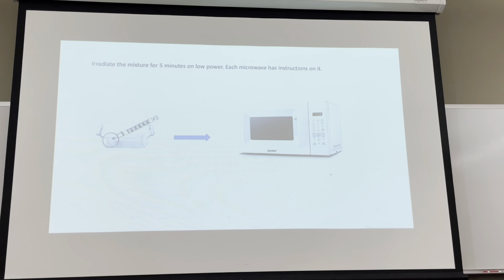Number one, do it slowly, because you don't want your separatory funnel erupting like the elementary school volcano. And number two, when you go to shake the sep funnel, you have to make sure you are venting with every turn, okay?